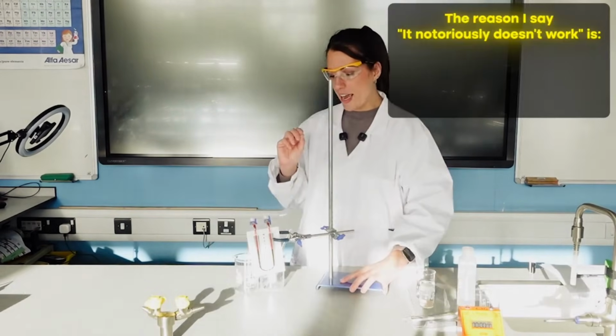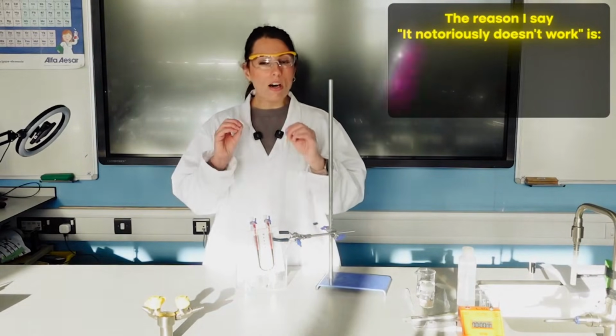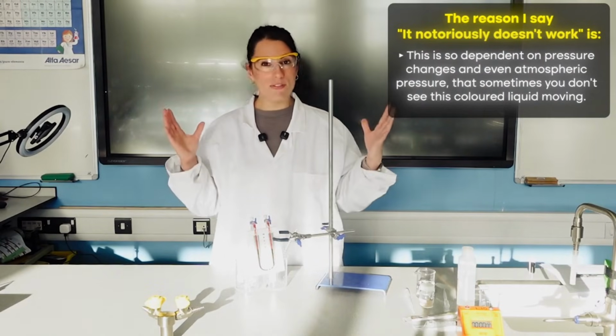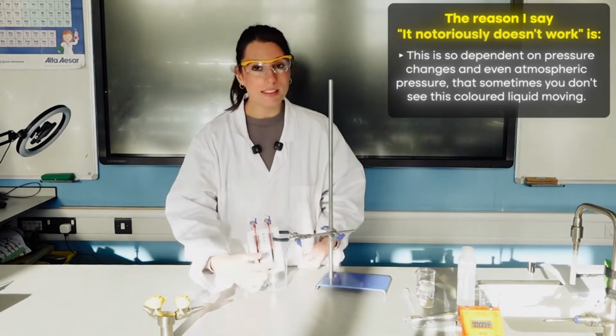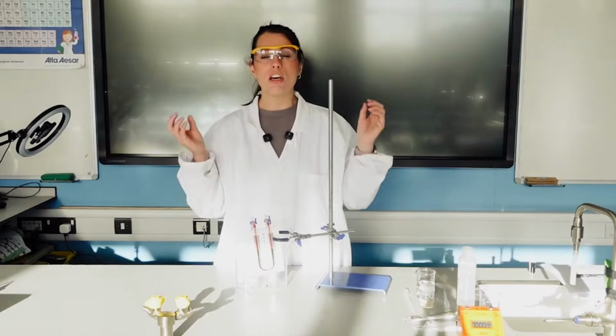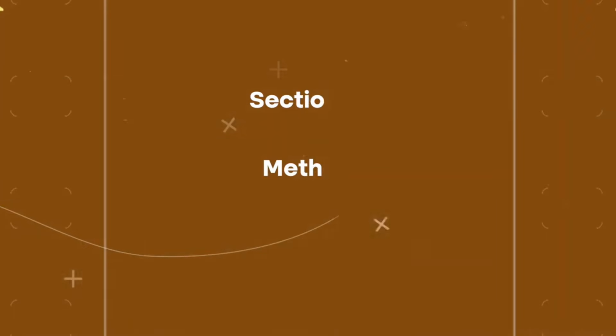Now, the reason I say it notoriously doesn't work is all of that theory and setup, because this is so dependent on pressure changes and even atmospheric pressure, you sometimes don't see this coloured liquid moving. And when I say sometimes, you rarely do. And if you have managed to get this to work, please write in the comments what you have done to get this to work, because I've not spoken to any teacher who has managed to have guaranteed success repeatably. So let's have a go.